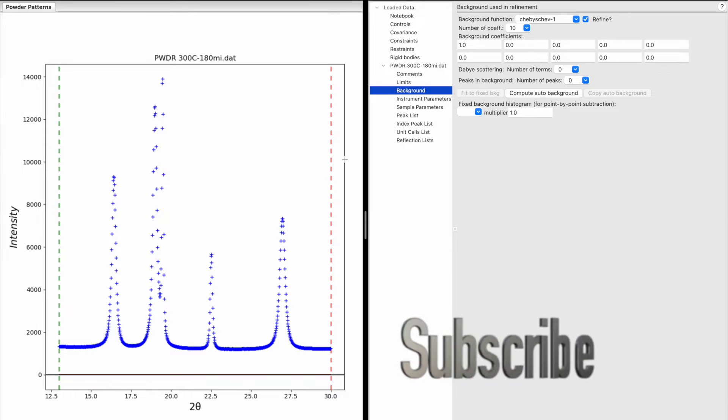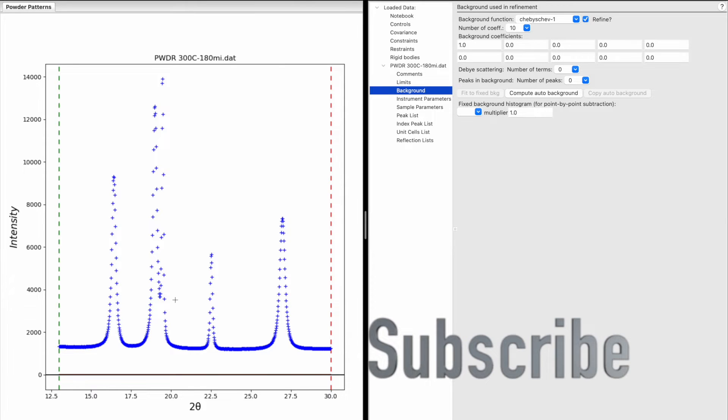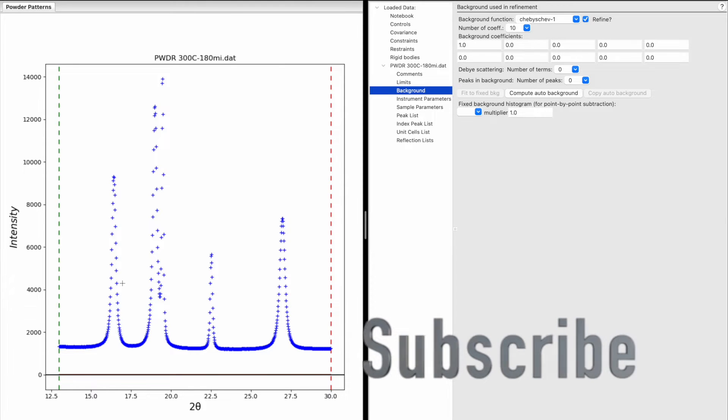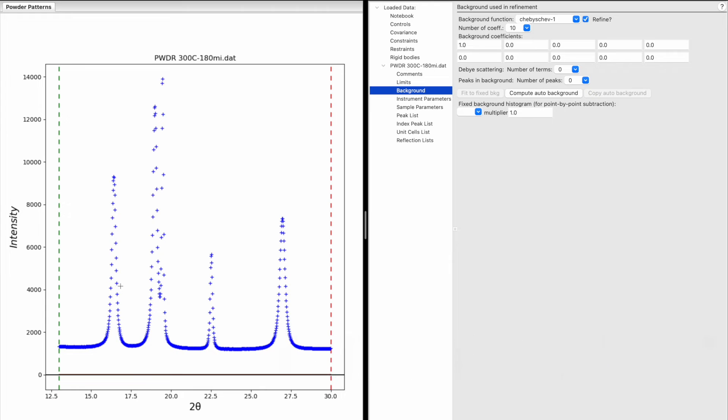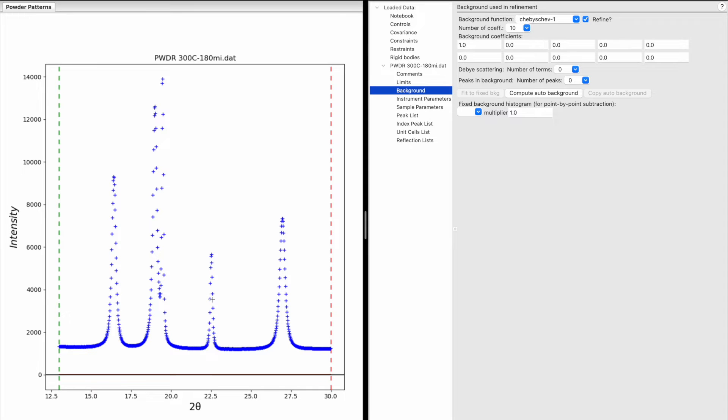From the XRD diffractogram, peaks 1, 2, and the last peak appear much broader, while peaks 3 and 4 look narrower. This suggests two peaks originate from one phase and three broad peaks from another phase.